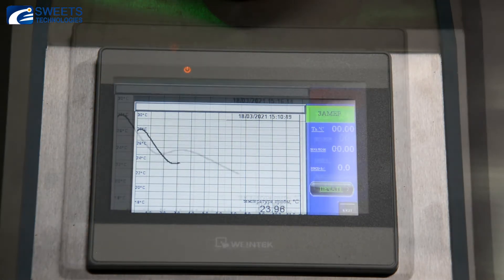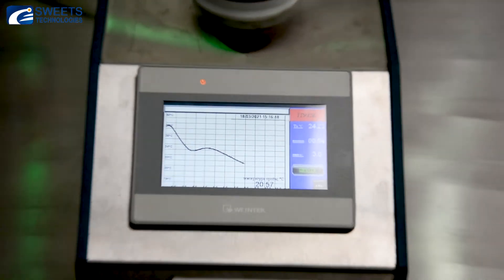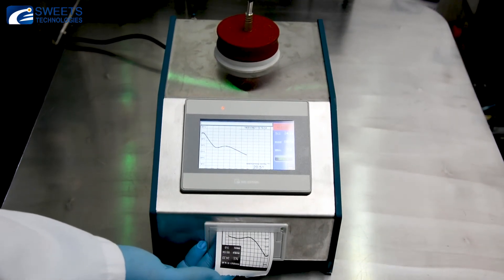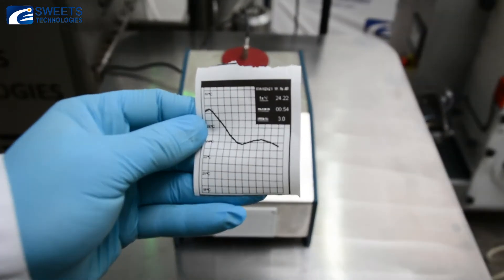The main advantages of the temperameter are that it is compact, lightweight, and easy to transport. It works on a built-in electronic refrigeration unit without additional refrigerants. The easy-to-use touch screen display gives out the results of tempering in the tempering index format.